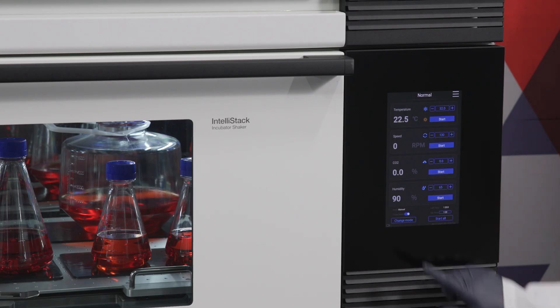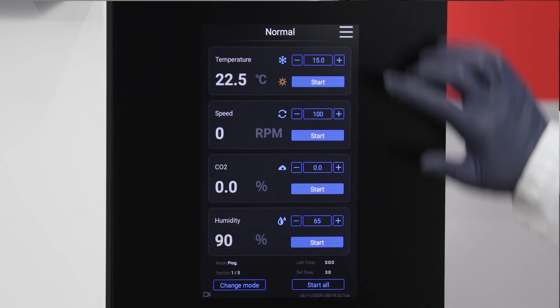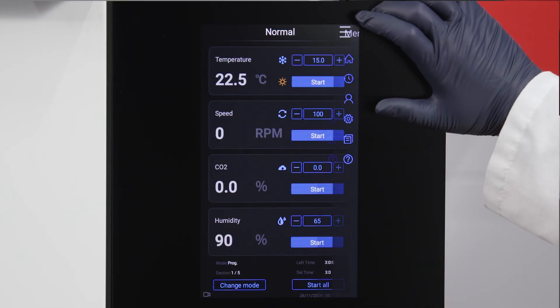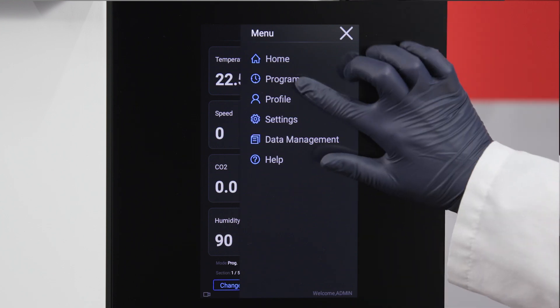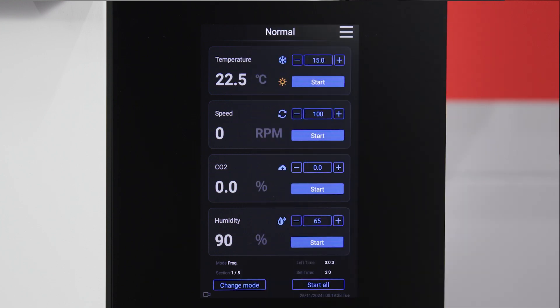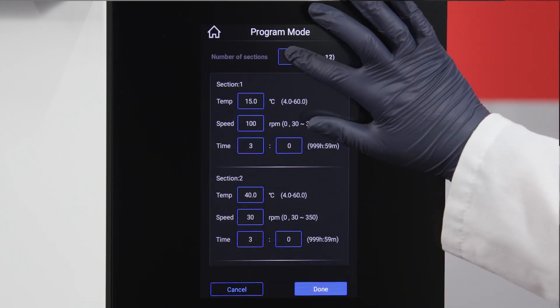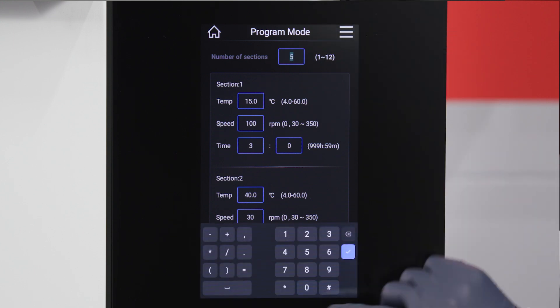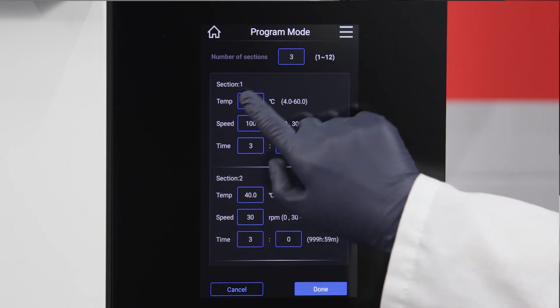Use the change mode button to switch to program mode. You can also access program mode from the main interface and adjust parameters by selecting program through the menu navigation. Set the number of sections and enter temperature, speed, and time parameters for each.